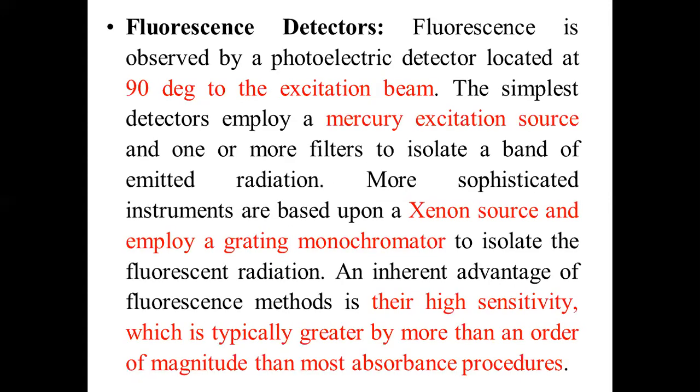If one has the knowledge of stretching frequencies, then use of these IR detectors will become very easy. Next, fluorescence detectors. These are the most commonly used detectors for HPLC. In order to understand the principle of these fluorescence detectors, you must be aware of the definition of fluorescence.